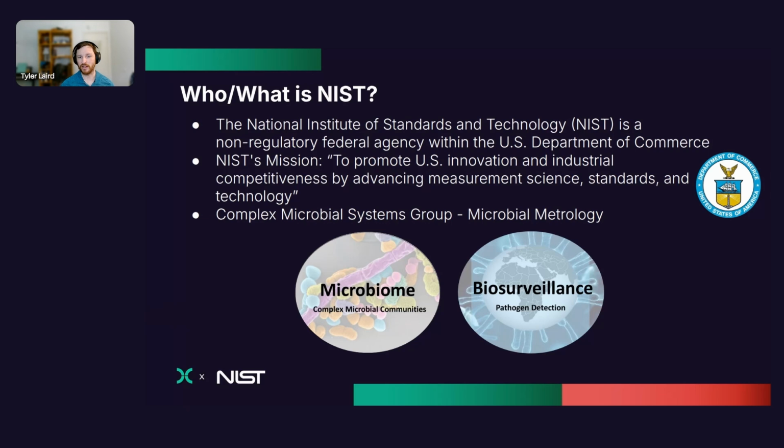I am part of the Complex Microbial Systems Group, which focuses on microbial metrology or measurements related to microbiology. We have two main areas that we focus on, one being the microbiome or measurements related to complex microbial communities and how that can be related to engineering microbial communities, as well as biosurveillance, which focuses on pathogen detection. And that's kind of where the VARITAS database and pipeline fit in.